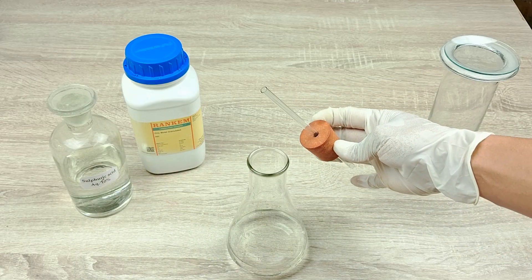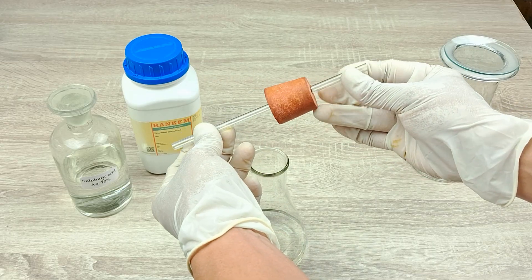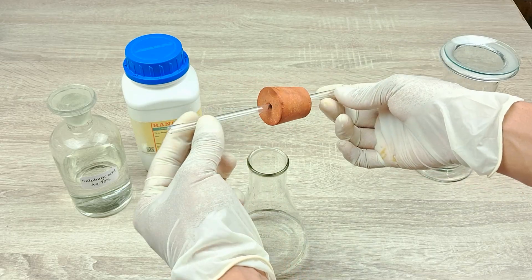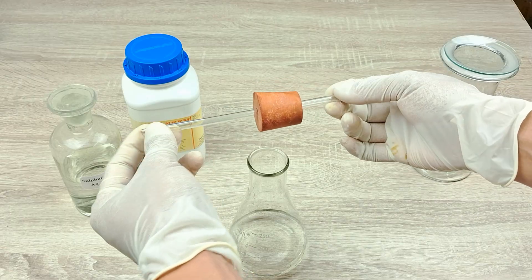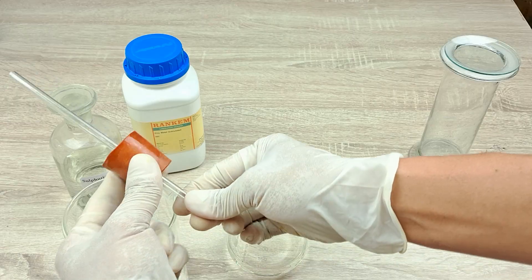Meanwhile, take the rubber cork with one hole and introduce the delivery tube into the hole. Allow about 5 cm length of the tube to protrude from each end of the hole. Moisten the rubber cork with water for an airtight seal.